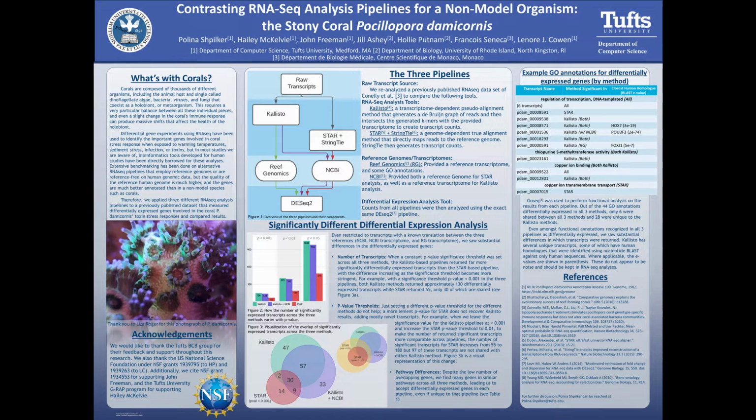We want to use RNA-Seq analysis to determine the changes in expression as the coral is exposed to environmental stress to identify genes relevant to the coral's ability to recover from bleaching. However, many RNA-Seq pipelines have been developed and tested specifically for human expression research. Some of these pipelines depend on the fact that we have spent years sequencing and annotating the human genome, and we simply cannot say the same thing for our knowledge of the coral genome. For many corals, we have no sequenced genome whatsoever.